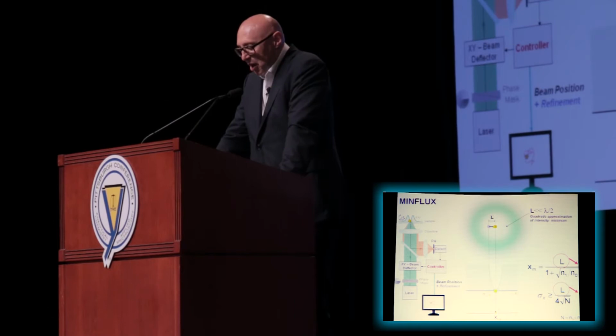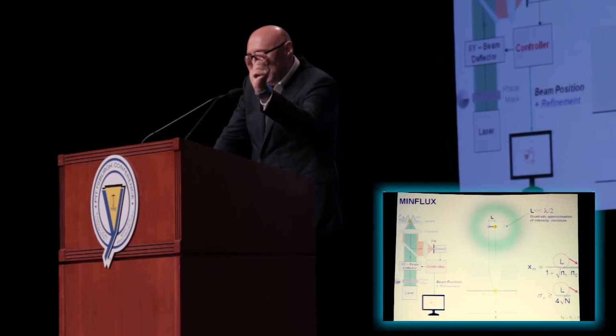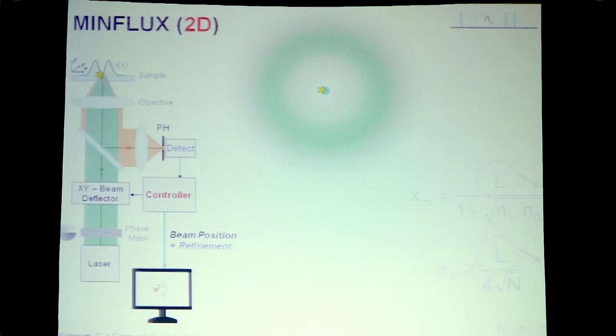So in other words, we can increase the precision by iteratively going down with the range where we look out for the molecule. So this is the essence of it. By the way, there's also no dependence on the molecular orientation, or only to a very, very high order, and so it doesn't really matter.